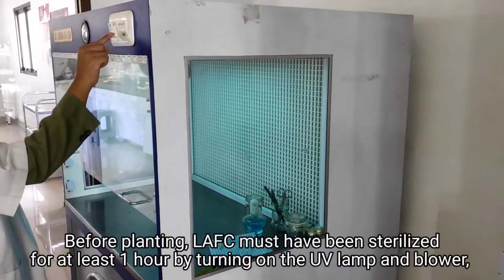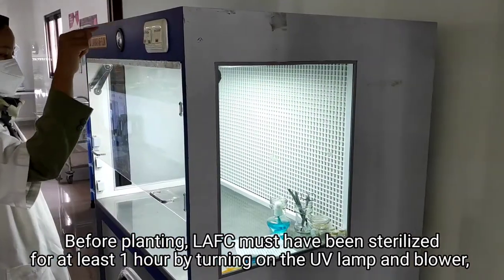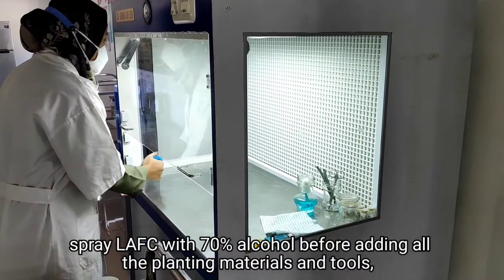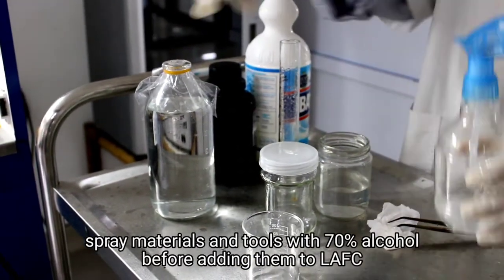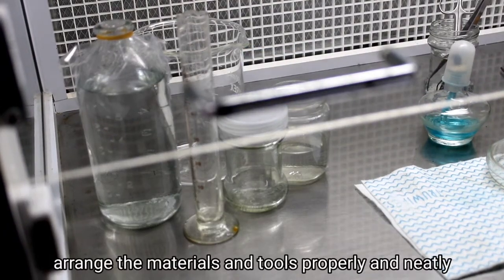Before planting, LAFC must have been sterilized for at least 1 hour by turning on the UV lamp and blower. Spray LAFC with 70% alcohol before adding all the planting materials and tools. Spray materials and tools with 70% alcohol before adding them to LAFC. Arrange the materials and tools properly and neatly.